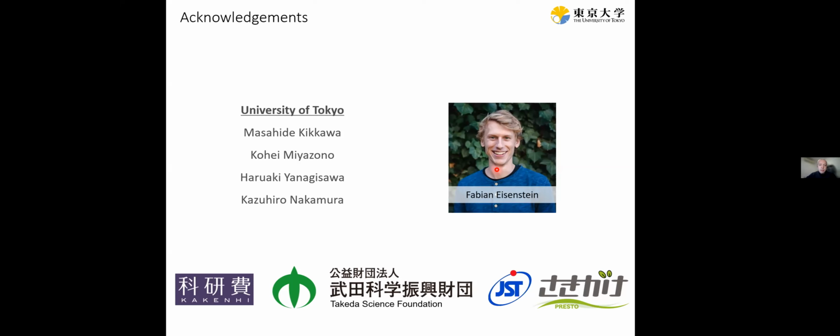And if you have any issues with it, you have one number to call. They come and they fix the whole system, and it's all made to work together. If you have two manufacturers supplying different parts, there are always issues related to service and compatibility. Like in our case, this issue with the first frame having the pattern noise is partially related to the fact that the K3 has to be integrated with the EPU. Because of this integration, they have to use a different version or something, and that messed things up. So I would definitely want to have a cohesive, single system.